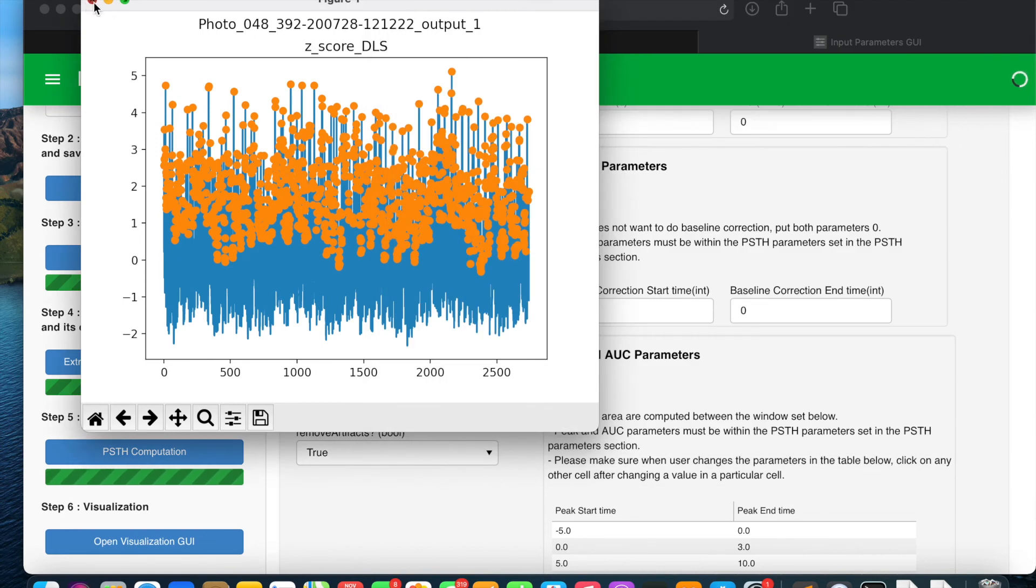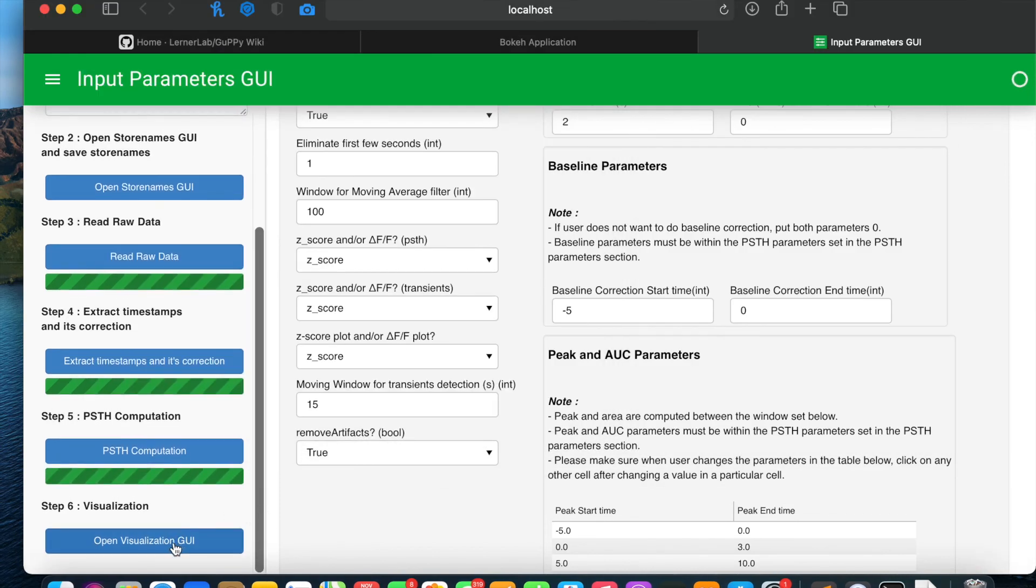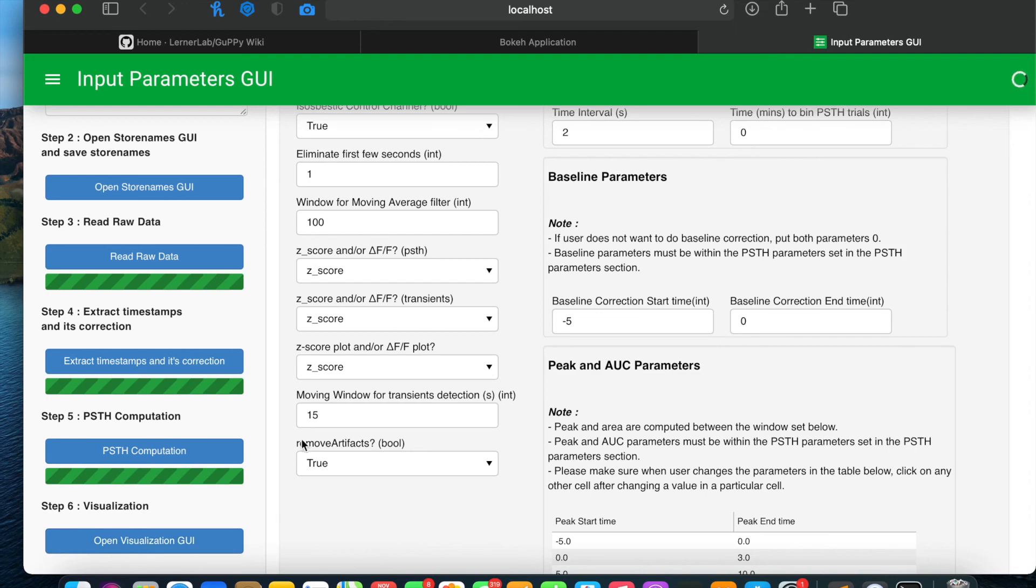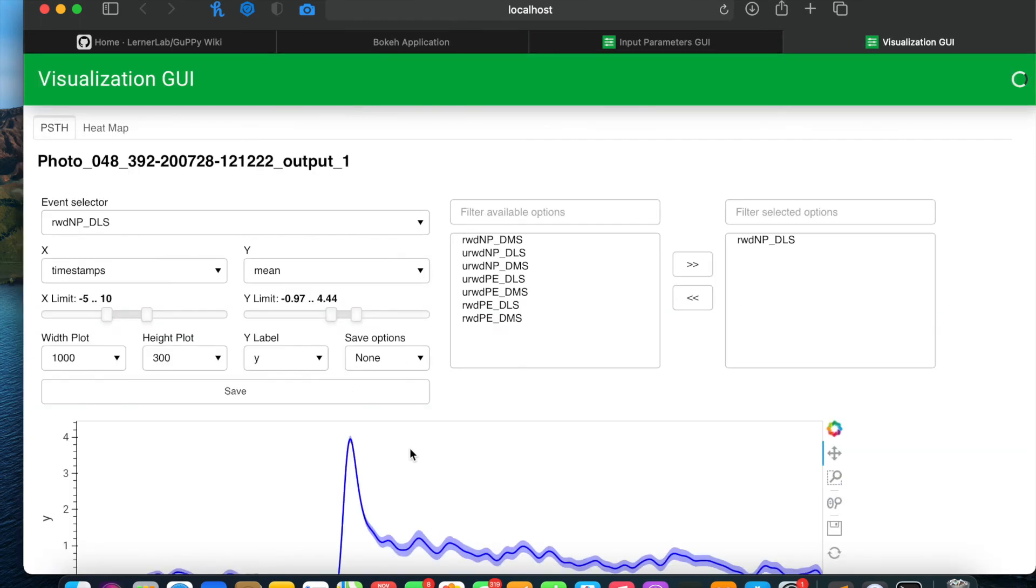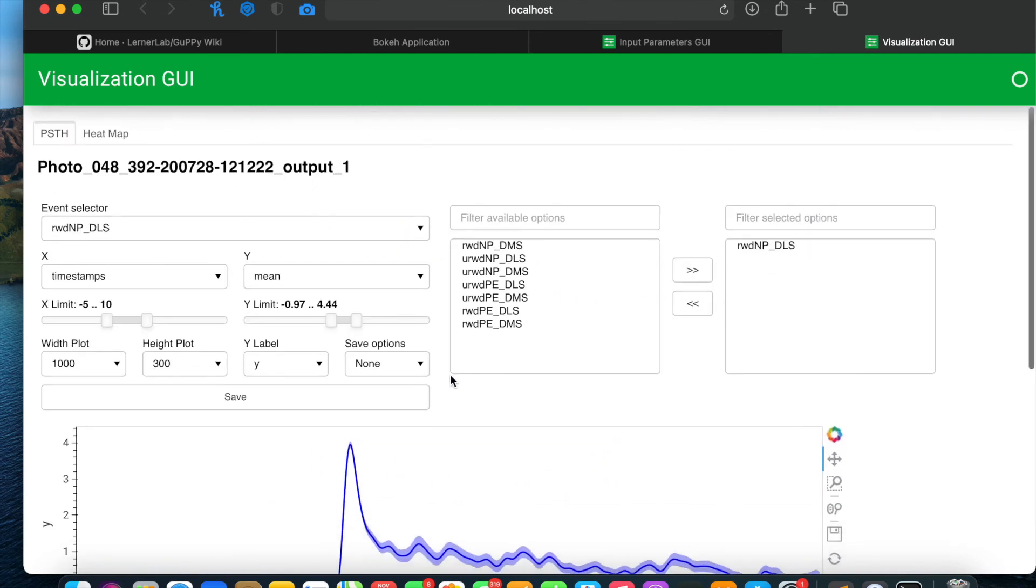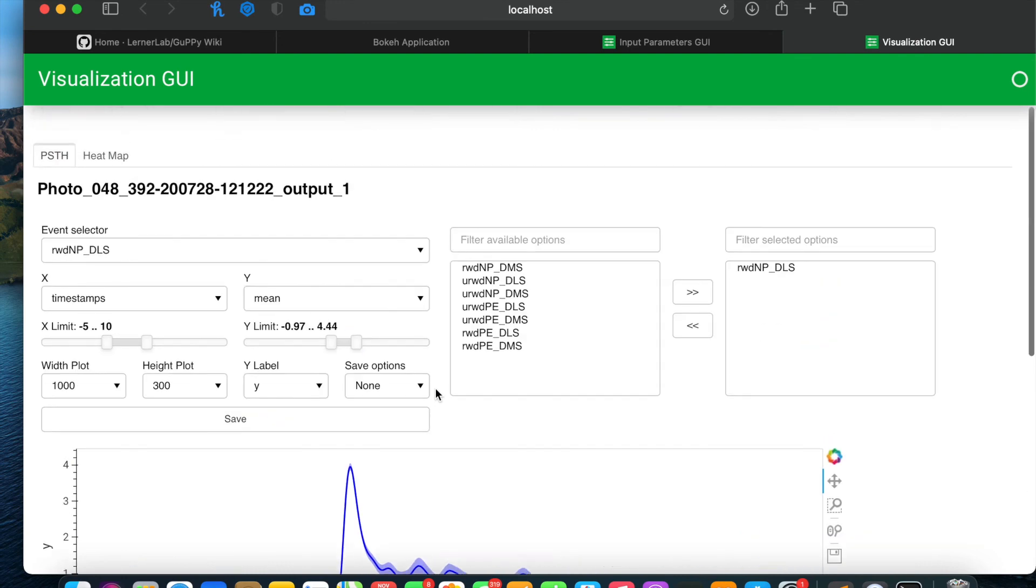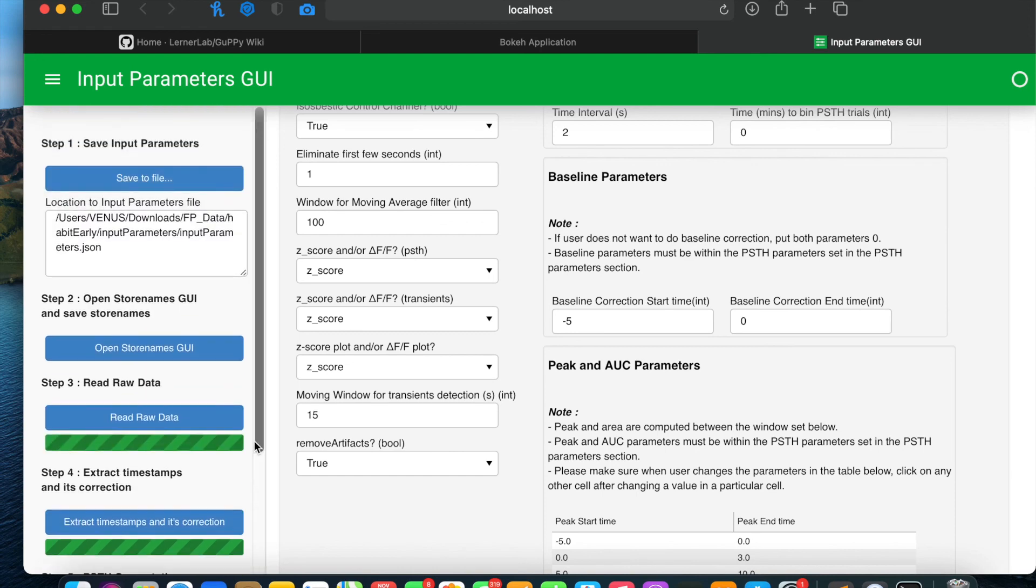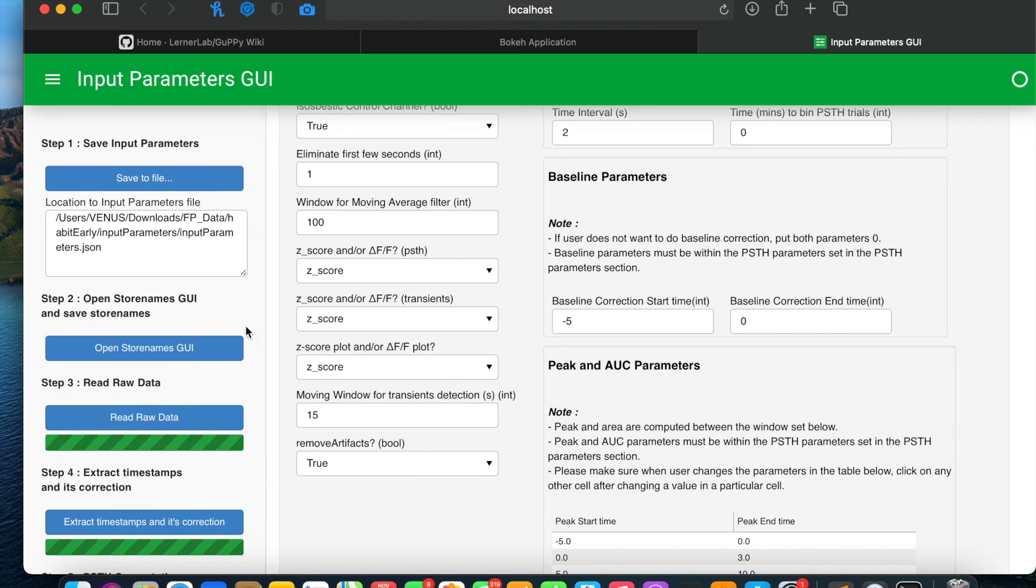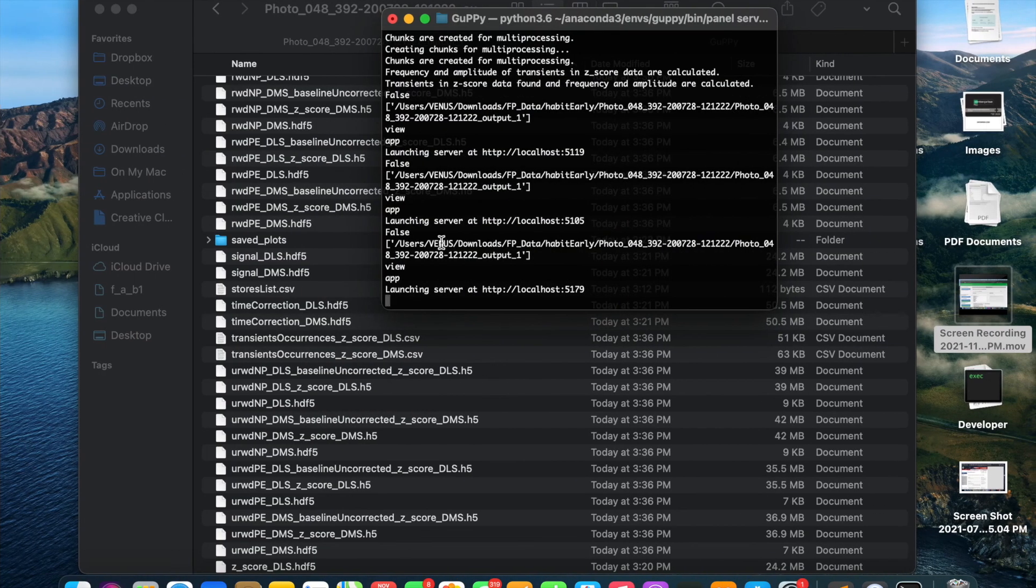Now I will open visualization GUI to check everything worked properly or not. Visualization GUI gets opened and everything looks good. All artifact removal process worked fine. This was the whole process to do artifact removal in the data when user has artifacts in the data. See other videos showing other features of GUPI.